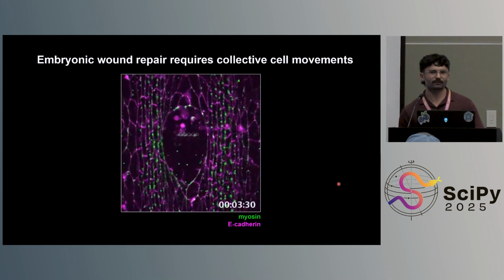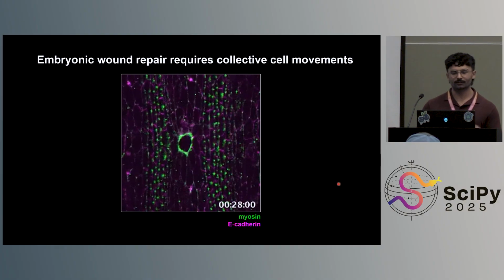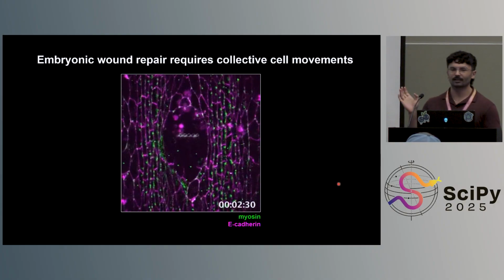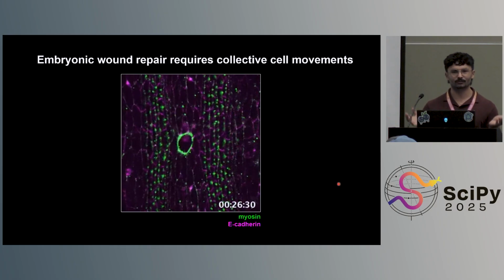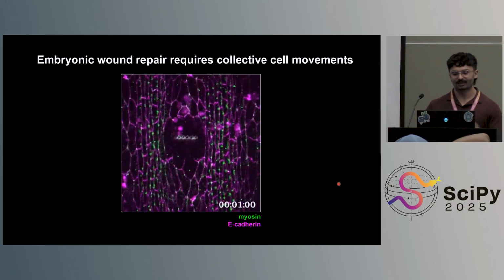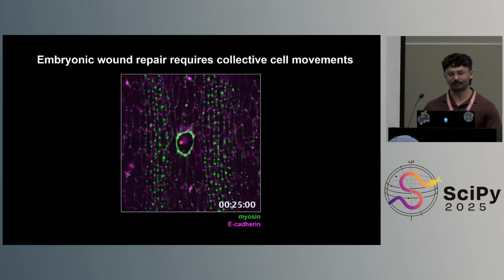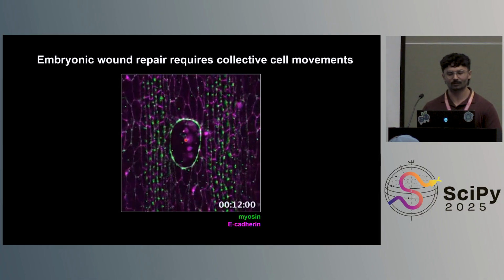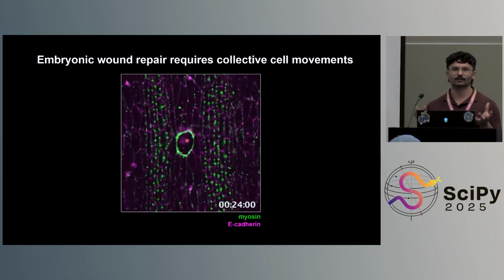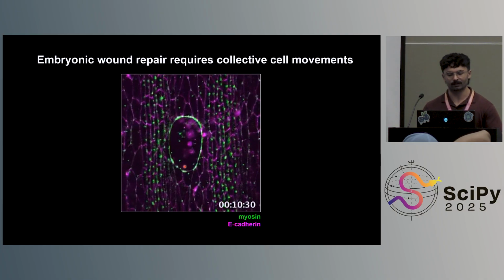And so just briefly, I've then gone on to use these networks to enable some of my own research. So I study embryonic wound repair in the lab, which means that I get to say that I shoot fruit fly embryos with lasers as my job. And that's exactly what we do. We take a high-power UV laser, we ablate 4 or 5 cells in the embryonic epidermis, and then we study how the cells around that wound work together to close over that wound area.